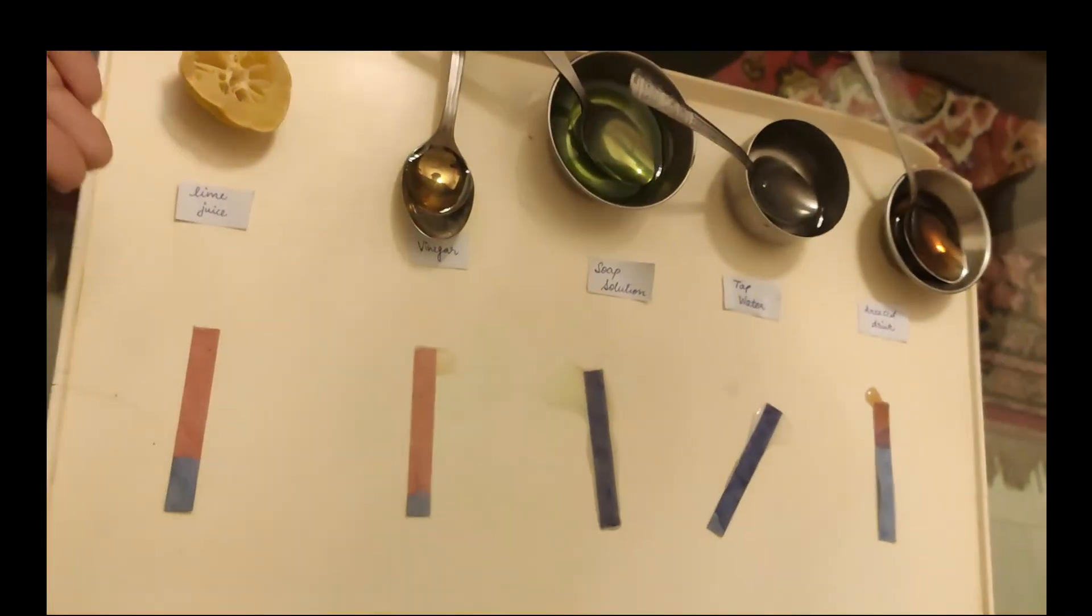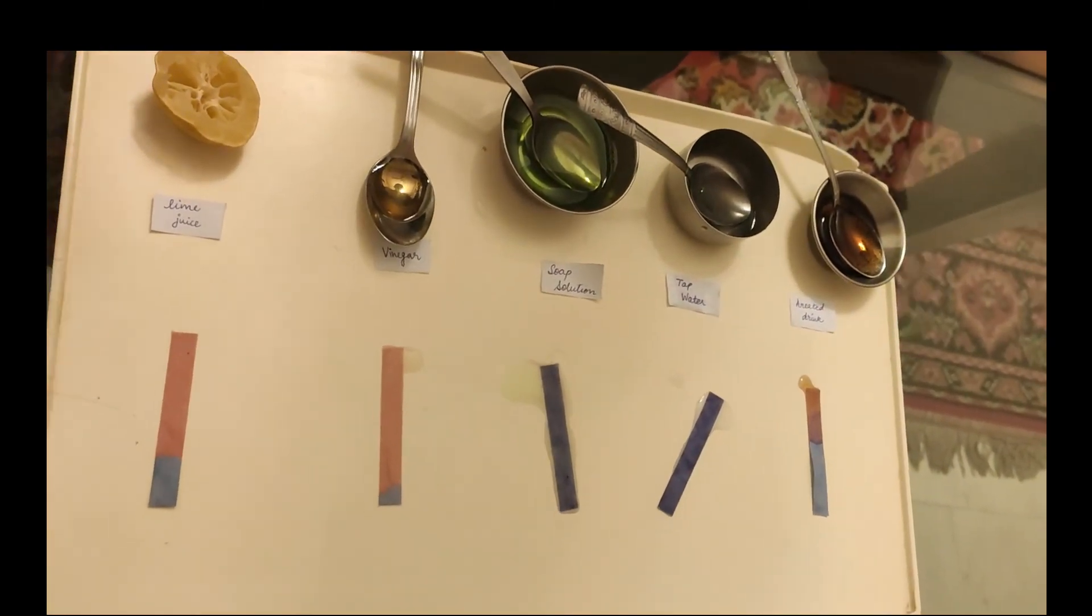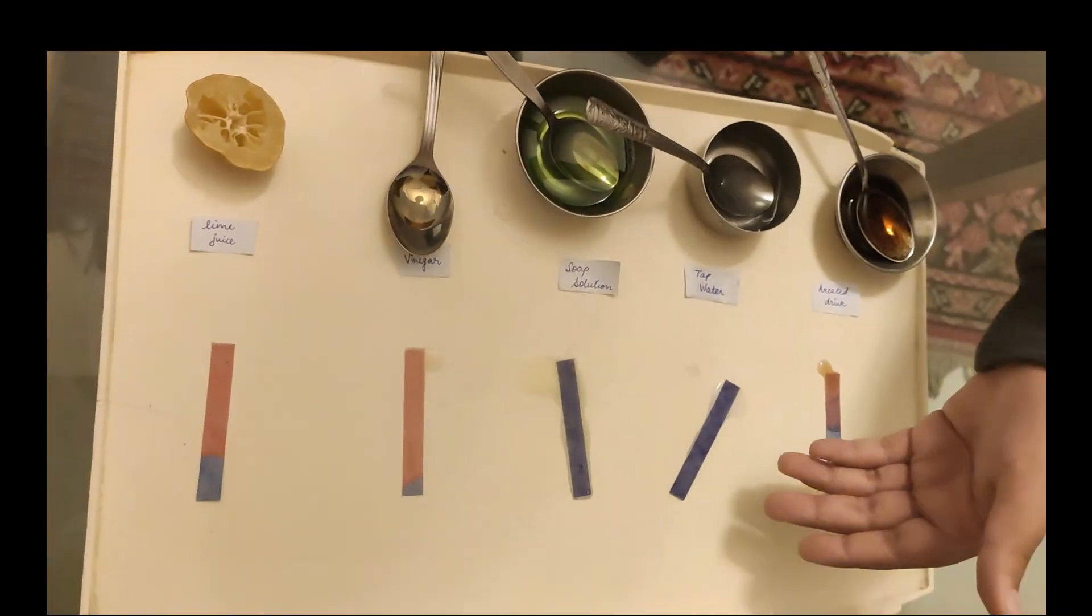Litmus papers help us to identify which objects are acidic and which objects are basic. Some can even be neutral.